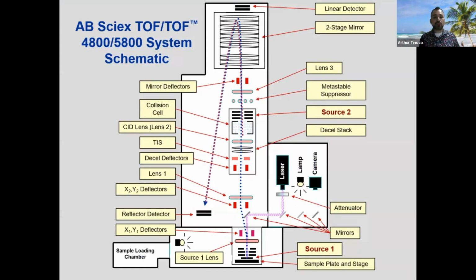And so essentially what you have is the following: at about the position of our hips is where you would put the sample plate, and that is where you'll have your source. So your plate goes into the source, you shine the laser, using a series of mirrors to orient the laser onto the samples, and that triggers the ionization process.